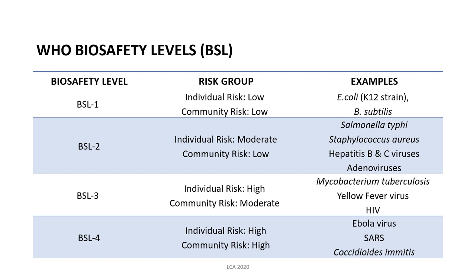The individual risk and community risk are low for microorganisms under BSL 1. For BSL 2, this includes agents that cause human diseases. For example, we have Salmonella typhi, Staphylococcus aureus, Hepatitis B and C viruses, as well as adenoviruses. Personnel working in these laboratories require greater attention to prevent injuries such as cuts and ingestions. For the individual risk, there is a moderate exposure to the microorganisms, and for the community risk, it is very low.